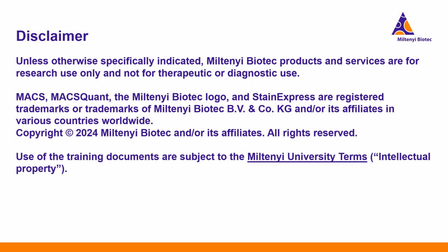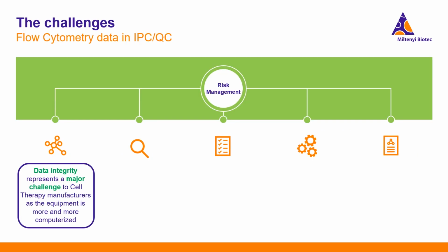Flow cytometry is a classic method utilized for in-process quality control alongside CAR T-cell or other cell therapy manufacturing procedures. Using flow cytometry data to ensure cell therapy product quality requires several considerations as parts of the risk management process.